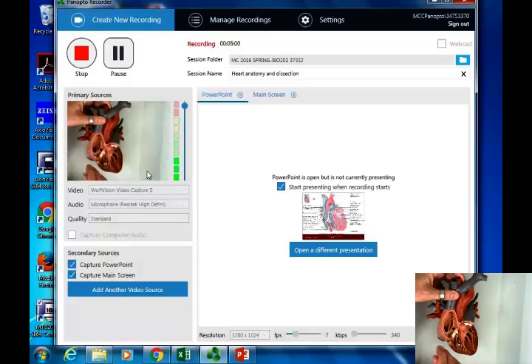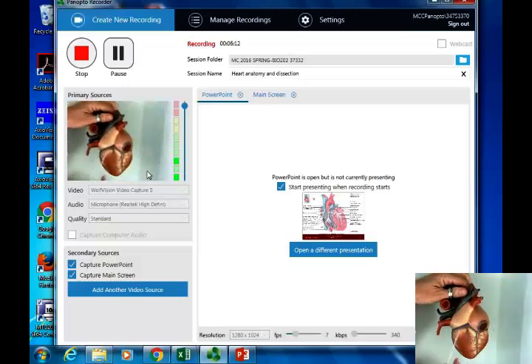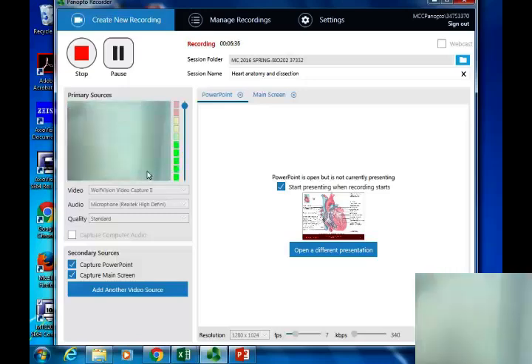Remember, this is the fossa ovalis, that little indentation in the wall between the right atrium and the left atrium. There's a little dark spot here, which is the opening for the coronary sinus. Remember, the coronary sinus is back here on the posterior side of the heart. It's this area where all of the venous blood is going to aggregate before it dumps into that right atrium. So you've got the middle cardiac vein that comes up between the ventricles. You've got the great cardiac vein that's curving around here on the left side, and they're all dumping right into here, which is what we call the coronary sinus, right in there. Okay. So let's take a look at something that is real instead.